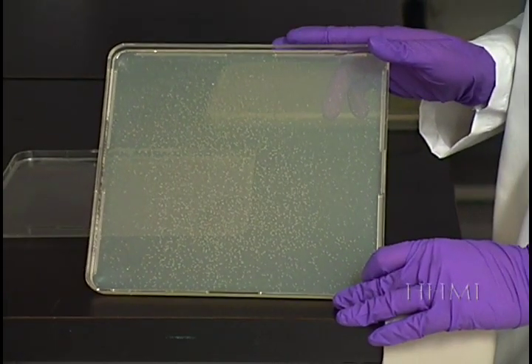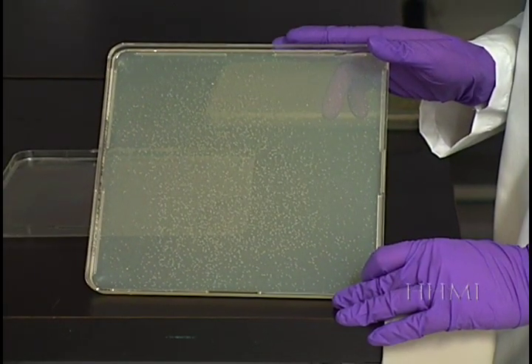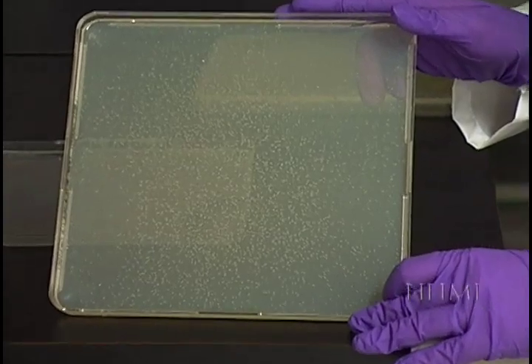The bacterial colonies have had about 20 hours to grow on the medium containing ampicillin and X-gal. The E. coli bacteria divide about every 20 minutes. So in 20 hours, we have about a million bacteria per colony.